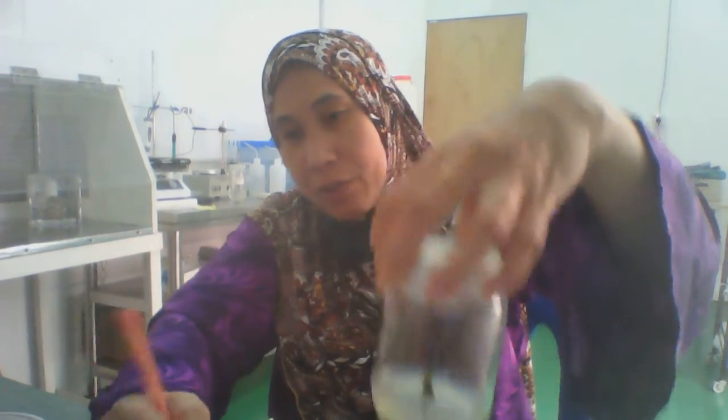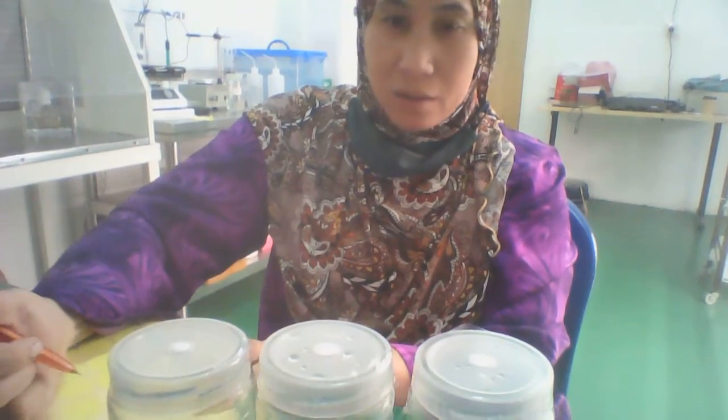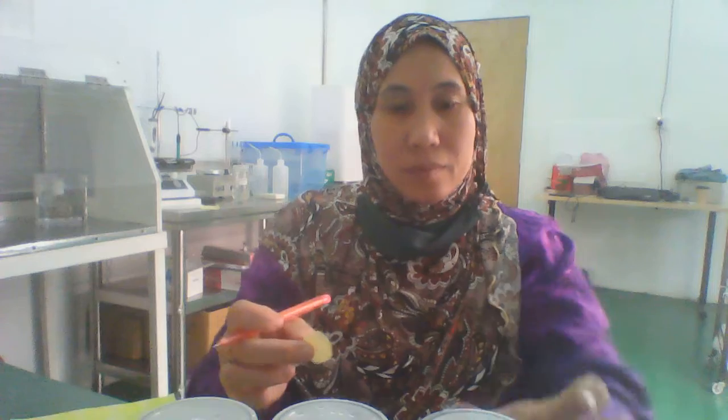I break it into three pieces from one subculture, from one plant. Sub 1. Three of it.